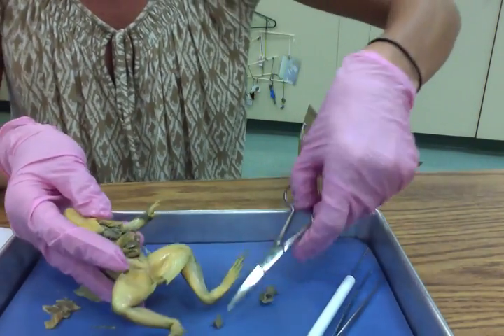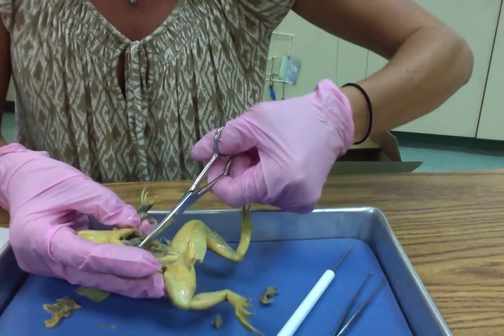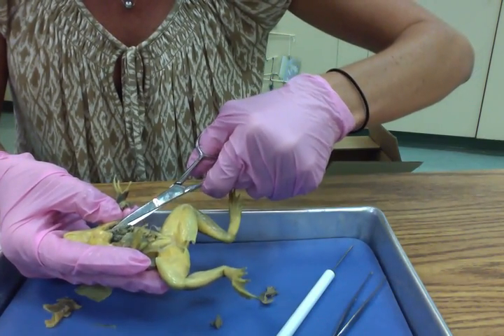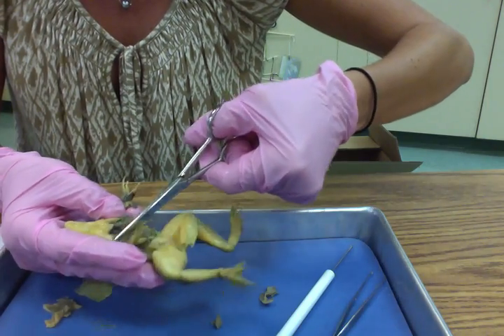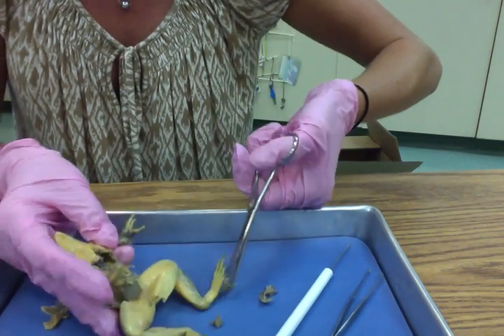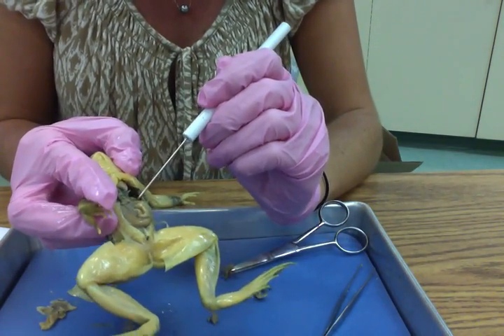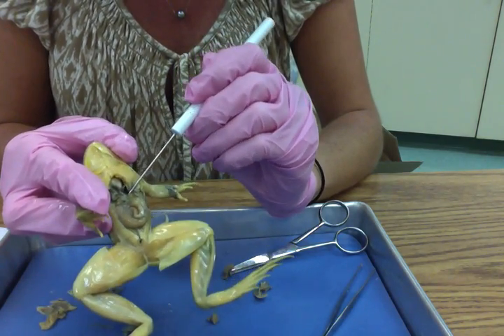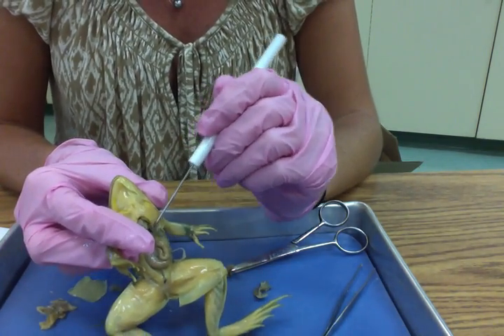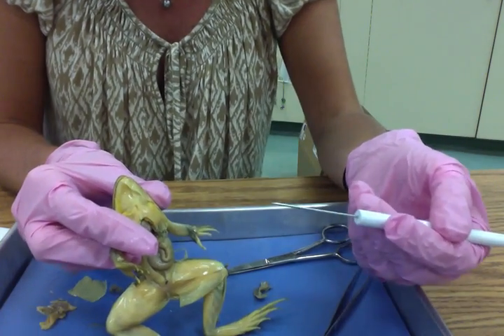Not ideal. Let's maybe try to use the scissors to cut the liver out. Okay. And you'll see that just under the liver there's kind of a little greenish sac. It's real small. That's called the gallbladder. And the gallbladder just stores the liver juices, which help to metabolize toxins and fats.